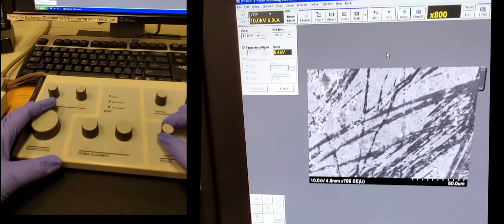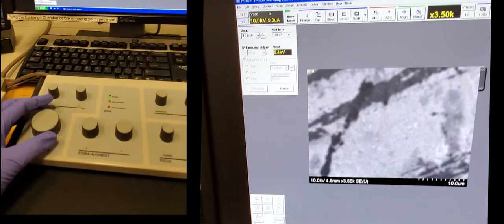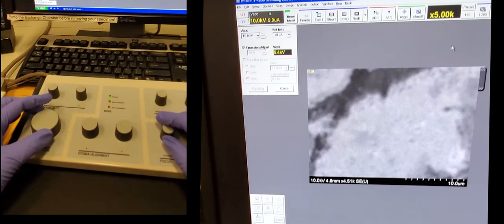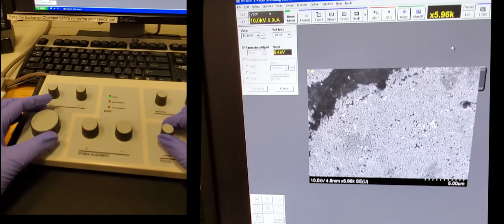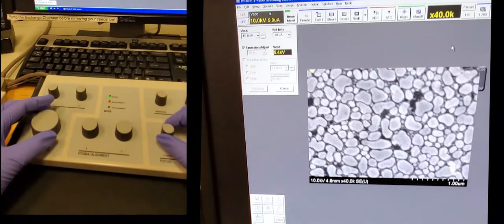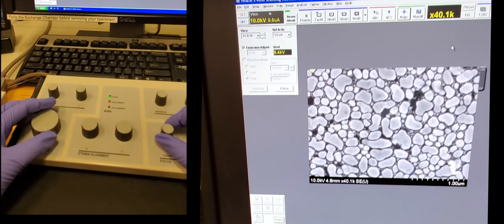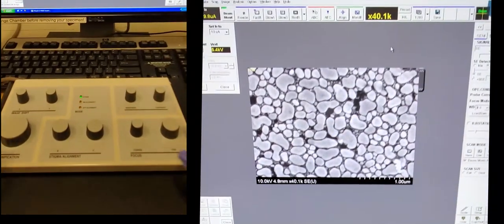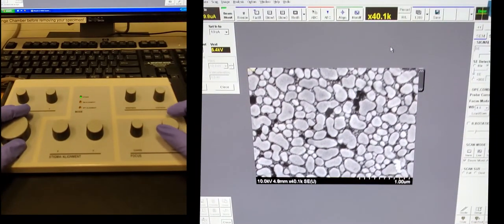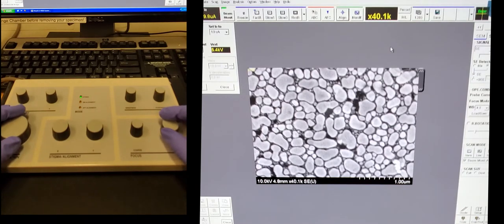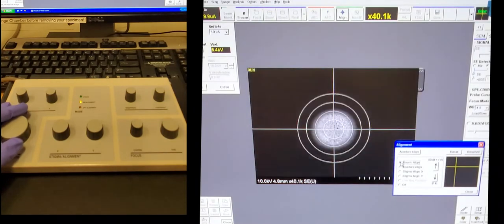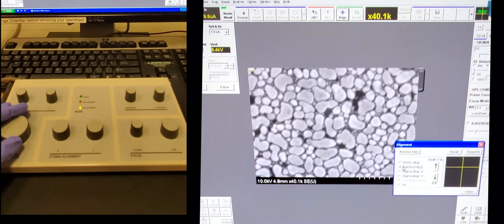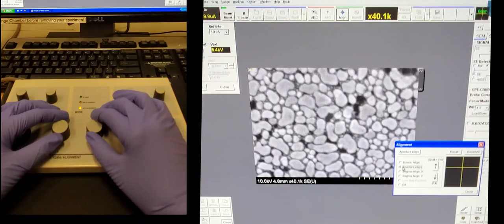So this procedure is the same as before. We magnify in, we adjust the focus, check the stigmatism, and then check the alignment looks good. So this one, the aperture is kind of off so let's minimize that wobble.